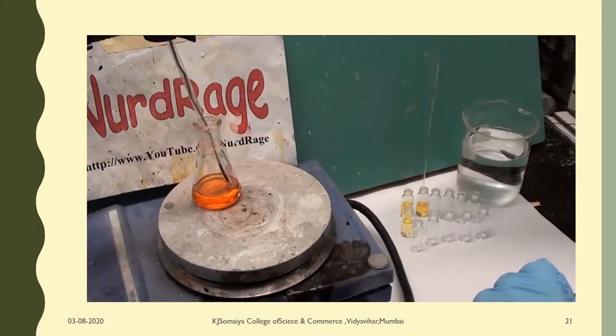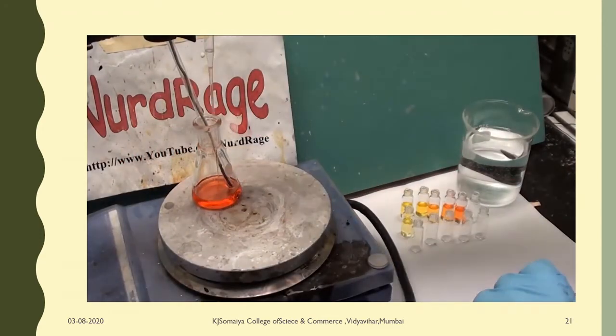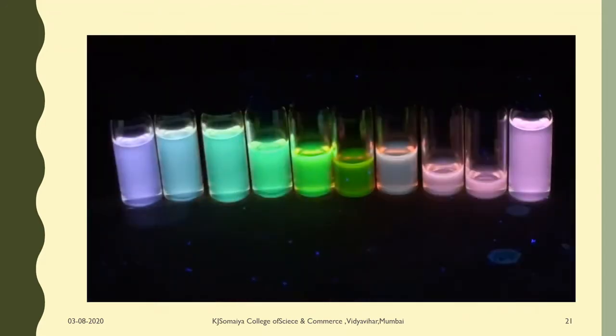Greetings fellow nerds, in this video we're going to make cadmium selenide quantum dots, a type of nanoparticle with interesting properties.